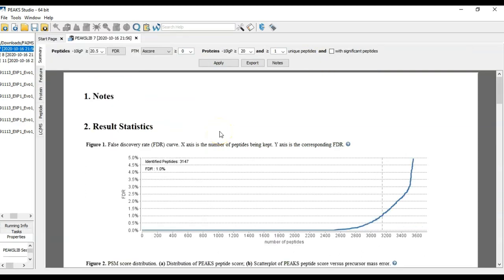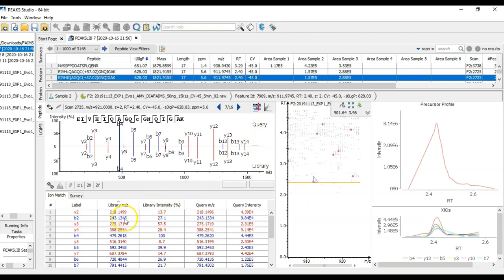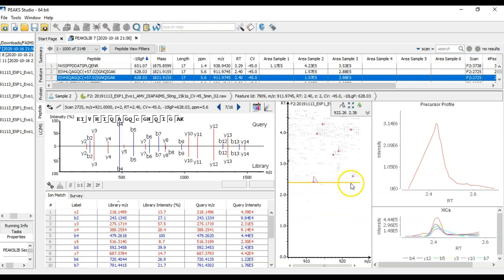Then you can go to the Peptide tab to see details about the different identifications. Notice here that the result page looks a little bit different for DIA data with a spectra library search, where you can see the mirror plot here showing the spectrum from our data set and a spectrum from our library, as well as the different library matched ions. Then here in the LCMS heat map, you can see where the peptide feature occurs according to the yellow line, which is the acquisition scan. These are different fragment ions associated with the peptide here below at the precursor profile.